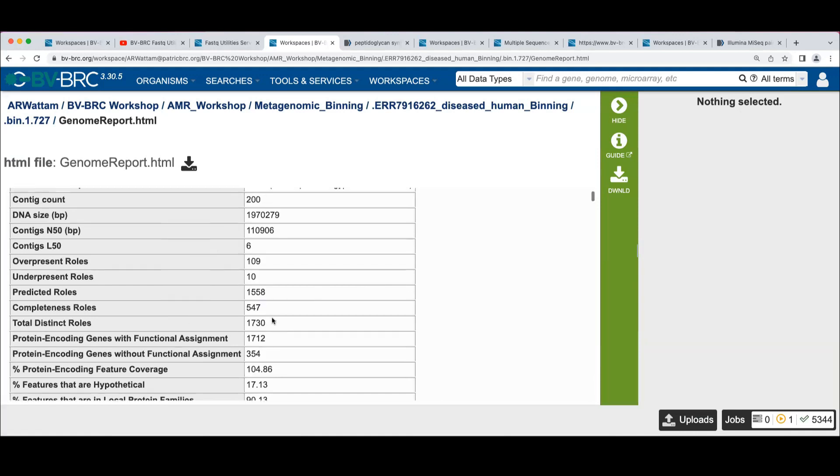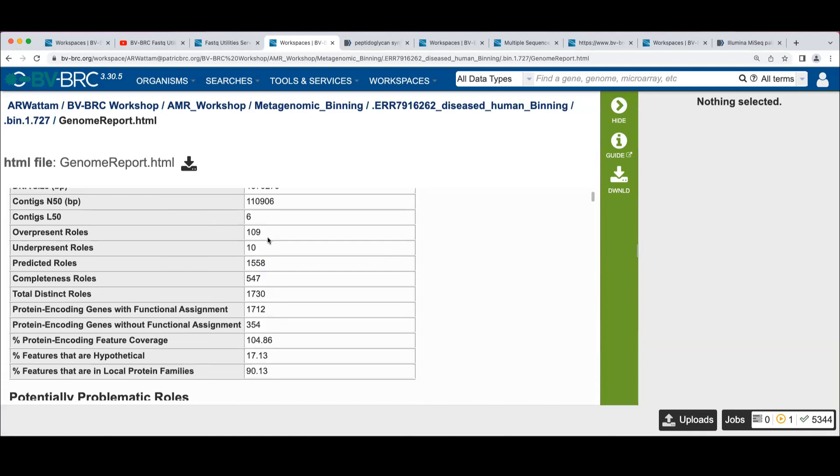So what we found is that we've got 109 roles that are over-present, meaning that there were more instances of the proteins in this genome than we expected. There are 10 roles that had fewer instances than we expected.